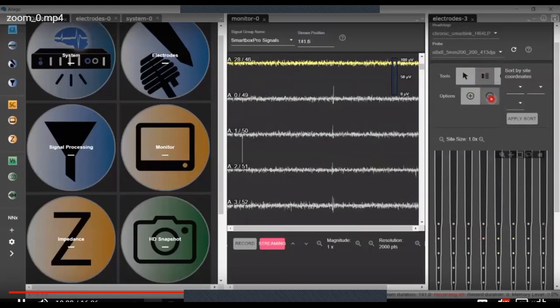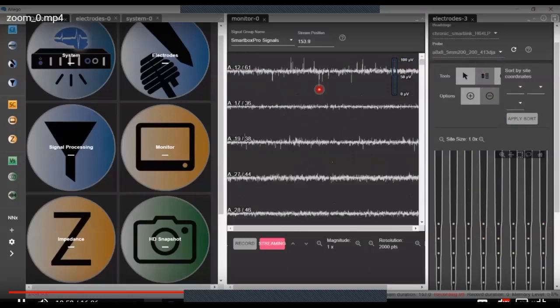Let's clear out. So I click on this negative tab and I can clear out any highlighted channel, come back to our default. So now we're in our defaults. Now maybe instead of picking a site that is of interest, maybe I want to create a pattern of recordings.